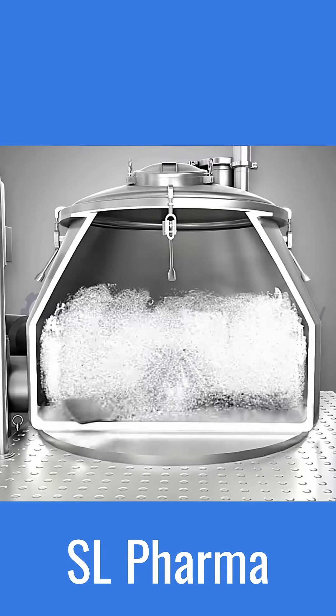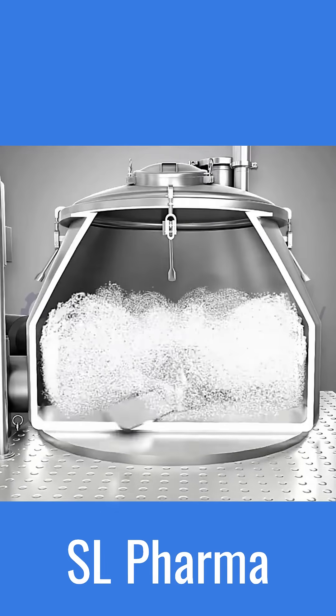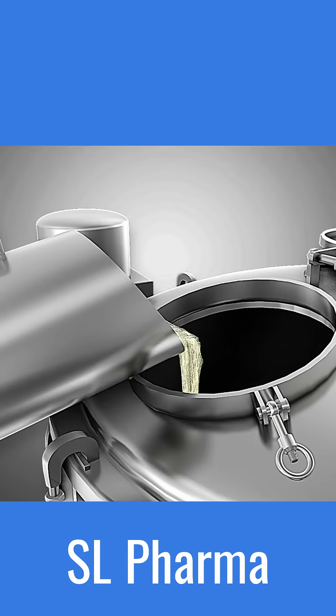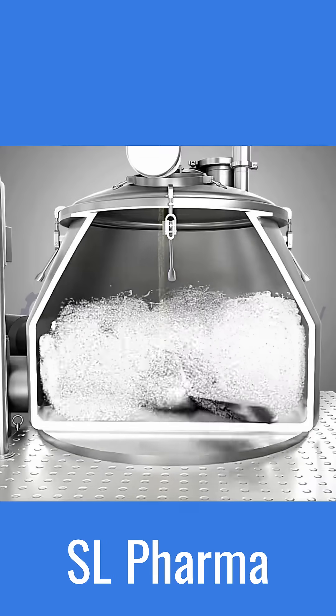High-speed impellers rapidly mix and granulate the powders. The impeller is responsible for uniformly mixing wet granules. A liquid binder solution is added to the powders in the mixing chamber. The high-speed impellers of the RNG rapidly mix the powders and liquid, creating a wet mass.